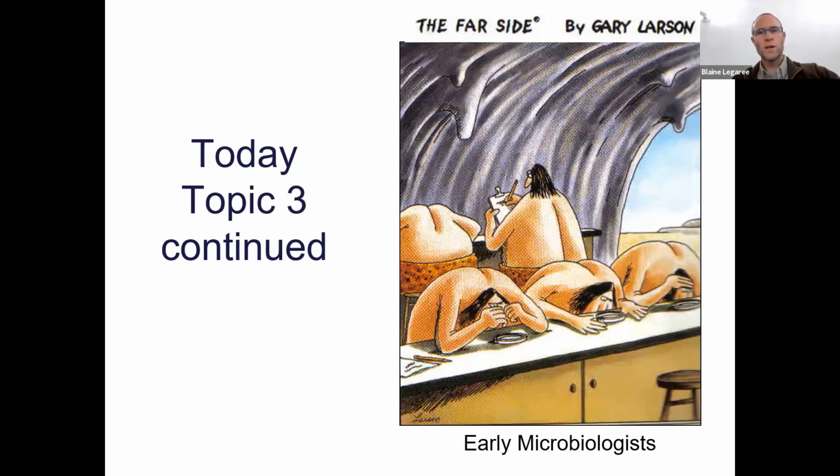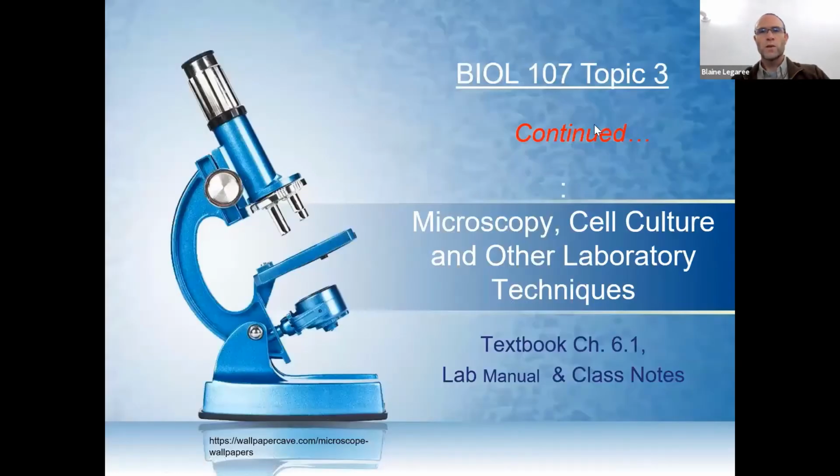Okay, so happy Monday. Today we are going to pick up basically right where we left off. Last day we were talking about microscopy, and we'll be continuing there and probably talk about a few other things related to studying cells. This will also overlap with tomorrow's lab, where we'll be talking about the microscope as well.